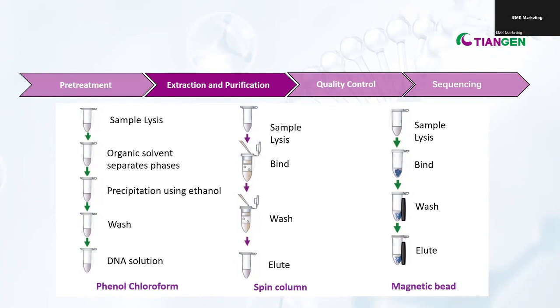As an alternative to the phenol-chloroform procedure, the spin column method has the advantage of not using toxic chemicals. Nowadays, most commercial reagent kits use the spin column method, which is a simple bind, wash, elute process. Nucleic acid binds to the silica membrane in the presence of high salt. Polysaccharides and proteins do not bind well to the column, and residue traces are removed during alcohol-based wash steps, along with the salt. This method requires multiple centrifugation or vacuum steps to flow liquid through the membrane.